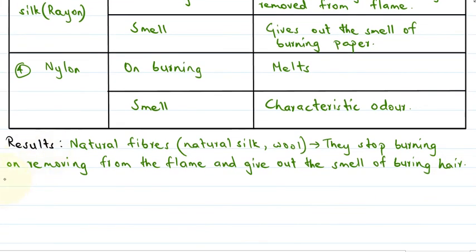Now what happens in the case of artificial fibers? Here we had considered rayon and nylon. So what happened?